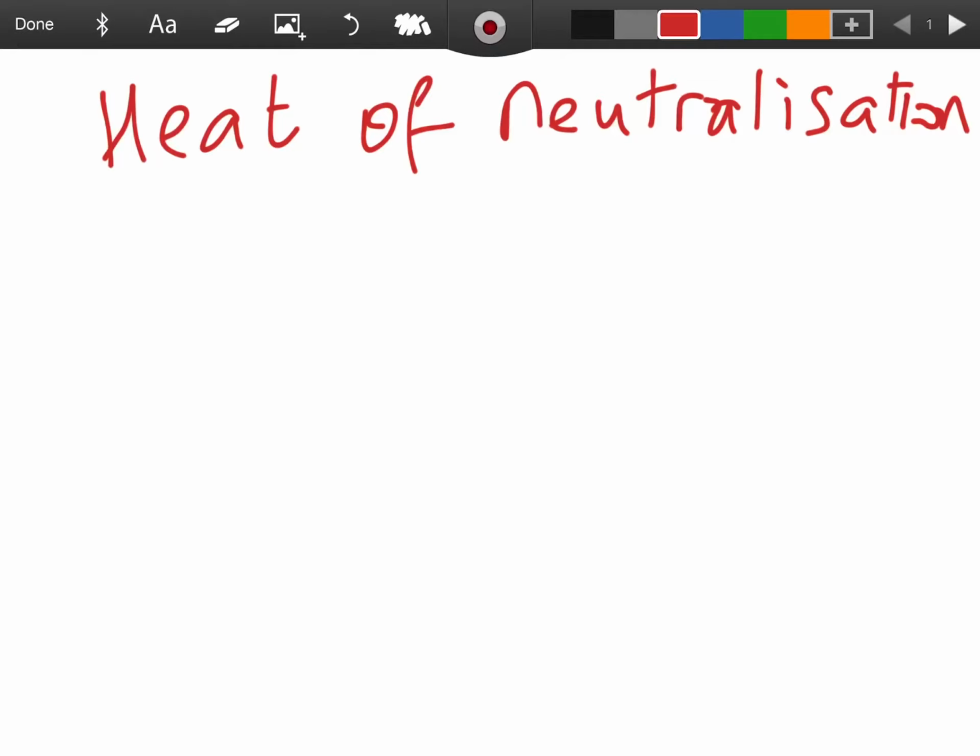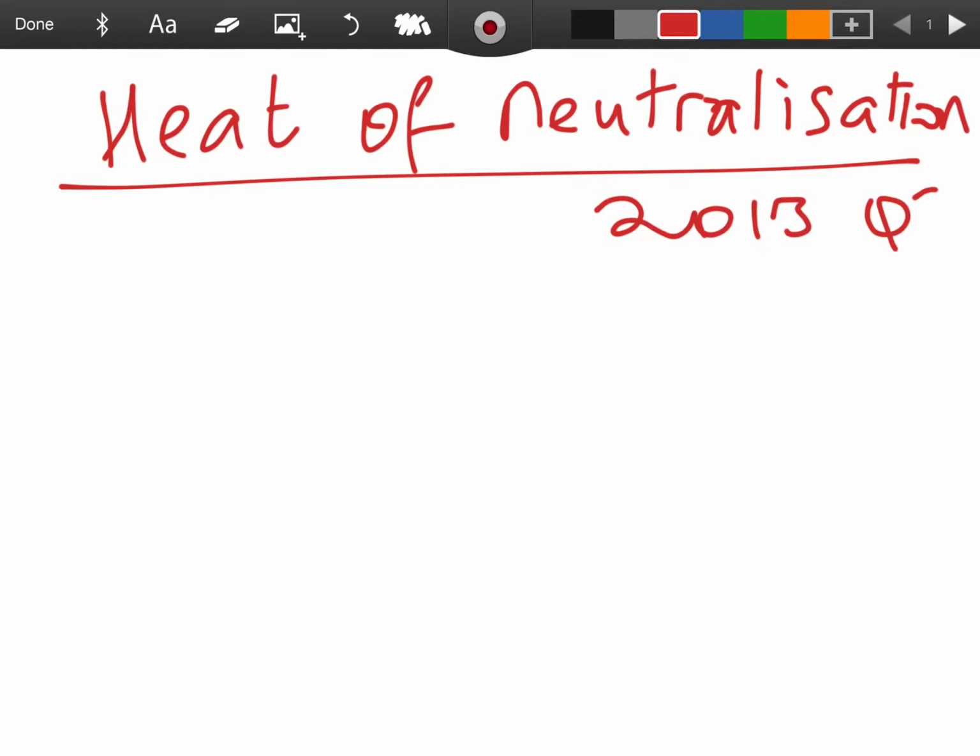So in this video, I wanted to run through the heat of neutralisation mandatory experiment. This is on page 205 of your revision books if anyone wants to open that. And the other thing is, I'm going to use 2013's question 3 as an example. So if you want to maybe open that now as well.